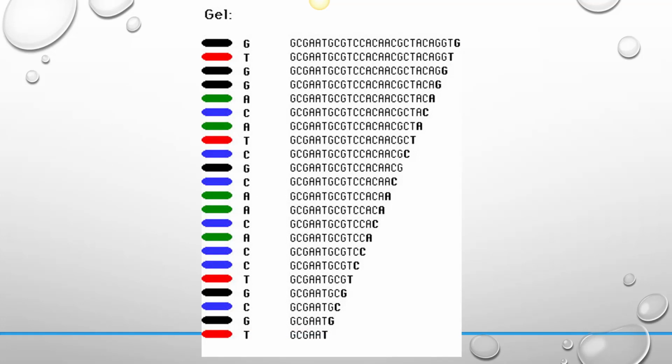But this is just an example of one type of DNA sequencing method. So it'll sequence and then incorporate these dideoxynucleotides, which stops replication at that point. And then when you run them out on a gel and use particular detectors for the different nucleic acid bases, then the shortest band will have the first base in a sequence. So then you read from the bottom to the top. So T, G, C, G, T, this is the actual sequence of the DNA.